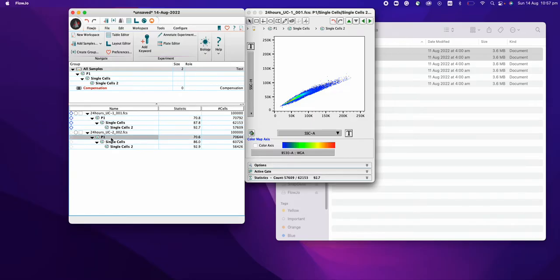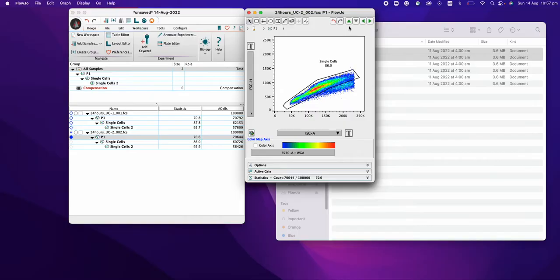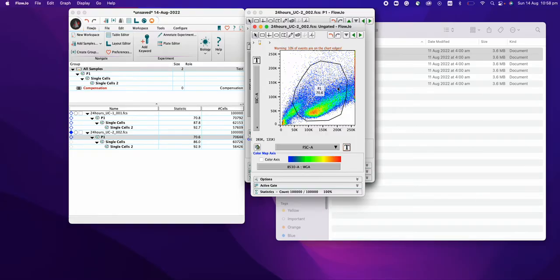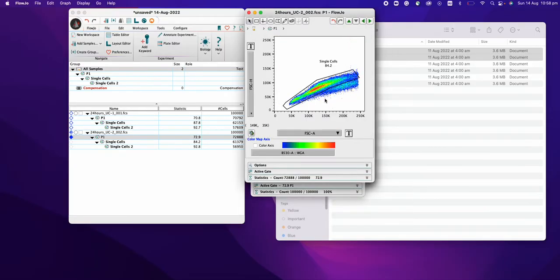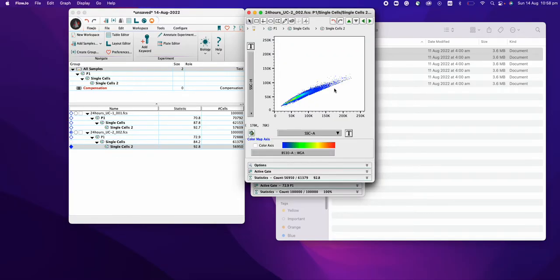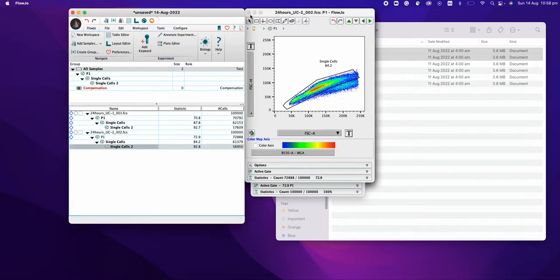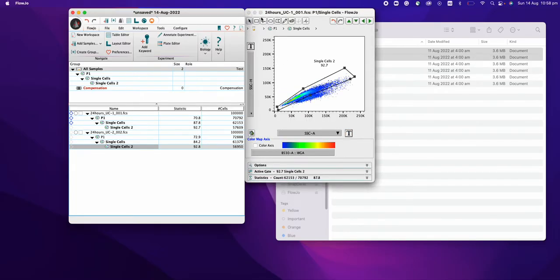Now going to P2, I'll check how it looks like. It seems to be good, similar range — a little bit more. Going down there, it seems to be good as well. It's the single cells. It seems to be good as well. All the things I'm looking for are cleaned up properly.